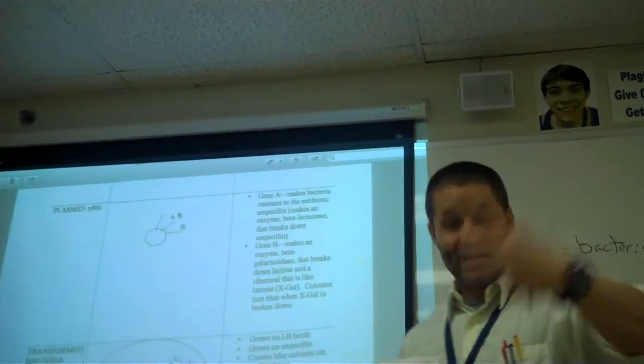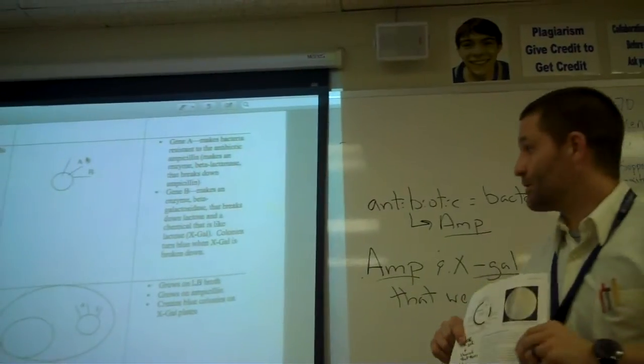So that's what it should look like at the very end. Okay, you guys see this kind of? And that little thing it's growing on, do you remember from Altech? That is like a transformation plate. That lady that had the agar plates that was looking at it, that's what we're going to be doing with this.